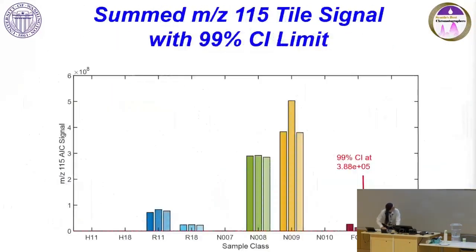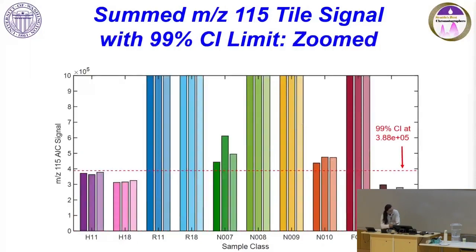Okay, so with that in mind, if we look here, we have each of our 3 duplicates for different samples. Again, the ones that very visually obviously had a peak, unsurprisingly have a lot of signal at the highest F-ratio mass channel. However, if we zoom in, we can see that this is our blank here with a different amount of signal in each replicate.